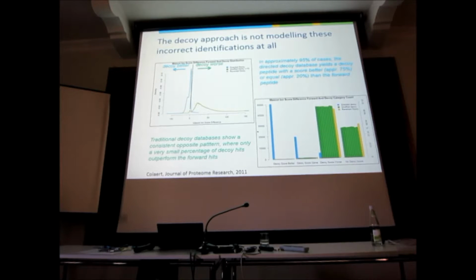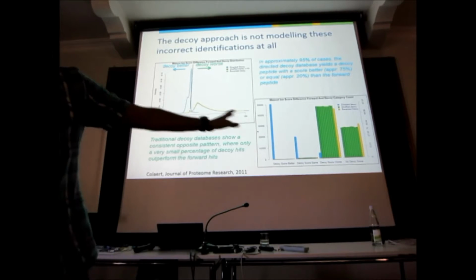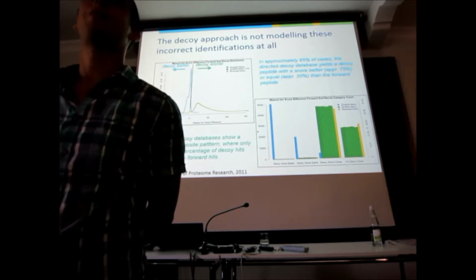This is exactly what you expect. When you look at our Photoshop peptides, nearly all of them give a better hit than the original one. And it's very dramatic. In 95% of cases, you get an imitator peptide that actually gets a better score or equal score than the forward. And 75% get a better score and 20% get an equal score. This means that if you give me any of your data sets, any one you please, and you give me a little bit of time to create imitators, I will give you back your data set and I will say for 95% of your identifications, I have an equal or better match.